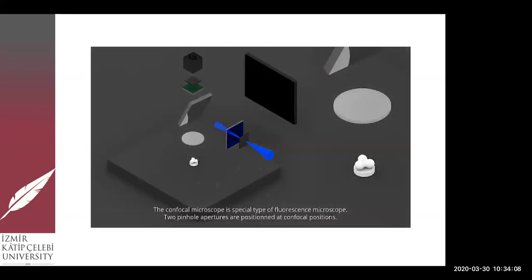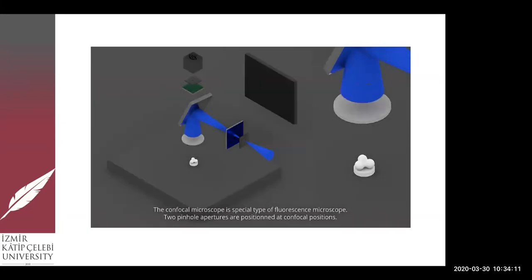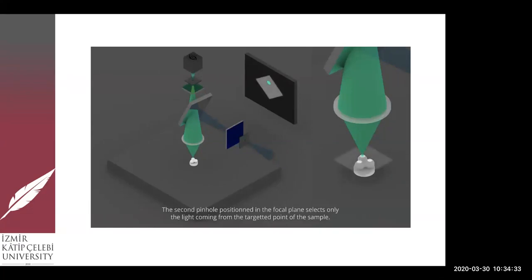We could see how much more complicated a confocal laser microscope is, with a higher number of components. We could see how the light is diverged and then converged, and as a result, only one tiny point of laser light is exposed to the sample. We could see here how the sample is read. The pinhole allows us to use one depth at a time.